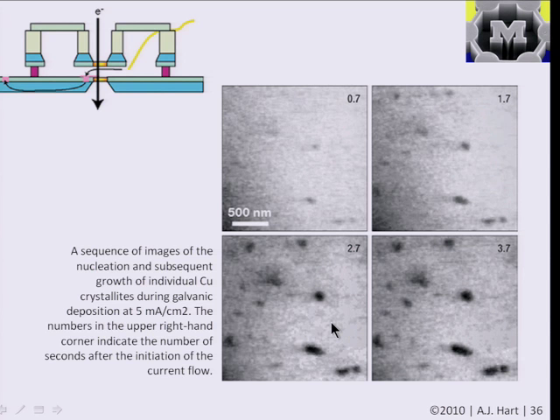And there's also work in, say, looking at carbon nanotube growth, and looking at materials diffusing and merging or assembling, and you'll find a wealth of literature on topics like this. You could say this is another one of those forefront areas where, rather than statics, we start to look at dynamics, and we start to look at the real processes as they go.